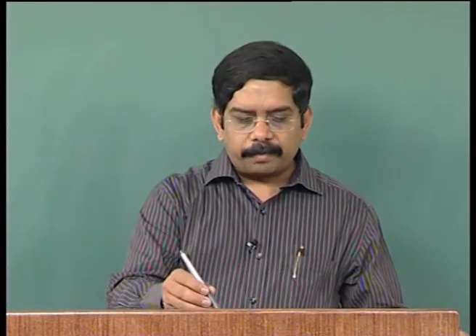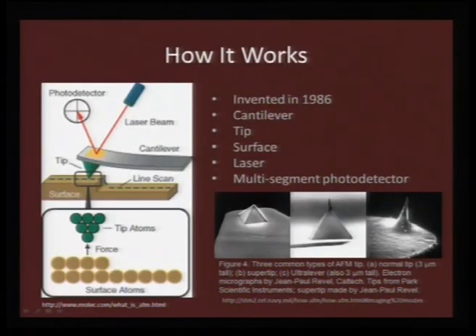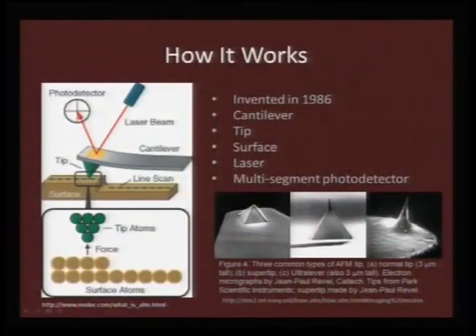It is just a simple micro tip scanning across a surface, and the way the topography is contoured here is based on laser beam deflection monitored by a photo detector. So this is the principle. This gives a luxury to most experimental people to study their materials, especially if they want to look at atomic scale resolution. There are several things that we can talk about.